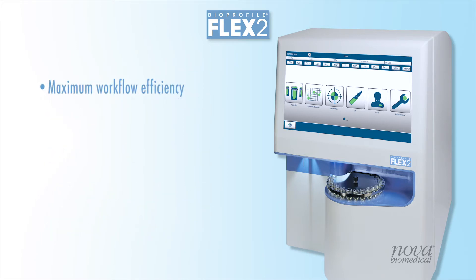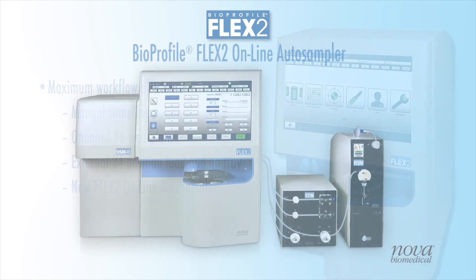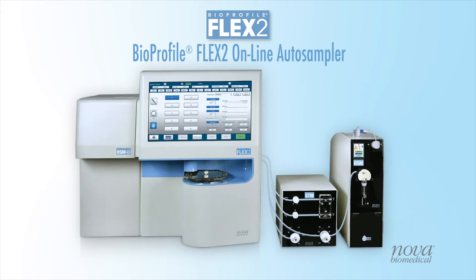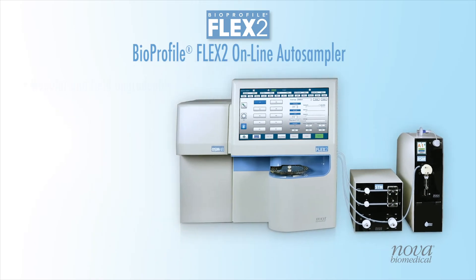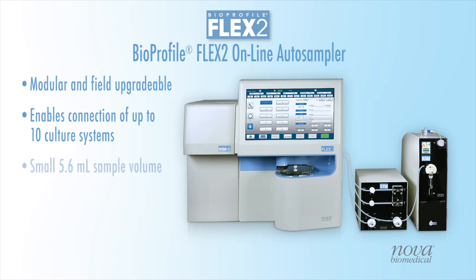Maximum workflow efficiency is achieved with four unique sampling options, including online automated sampling with the Flex2 Online Auto Sampler. The Bioprofile Flex2 Online Auto Sampler, or OLS, is a modular system that connects Flex2 to as many as 10 bioreactors for automated sampling and analysis of key cell attributes.